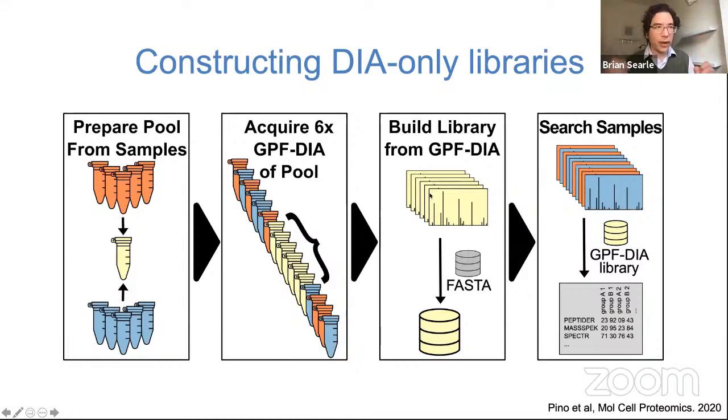I detect all of the possible peptides out of this data set. Again, 2 m/z wide isolation means that this is as good as DDA based isolation. You're seeing those peptides with the same type of isolation that you would with DDA, except you're actually able to see the apex of the peak, not just the shoulder of the peak, for collecting the MS2s. They're just much deeper.